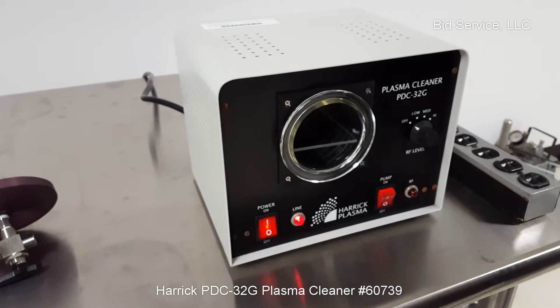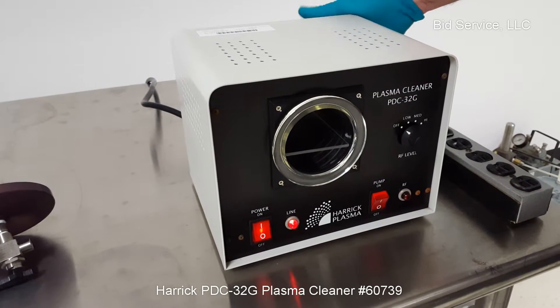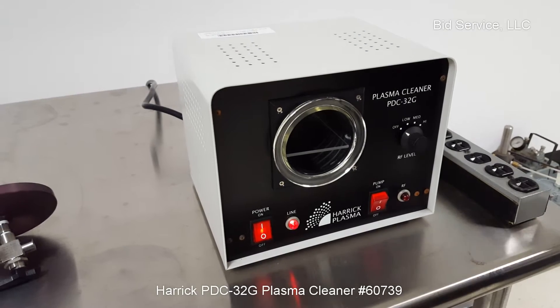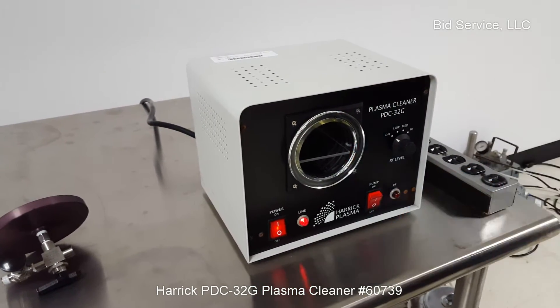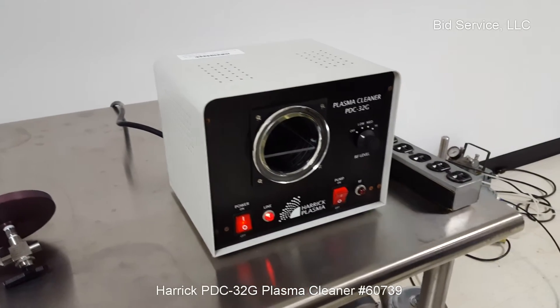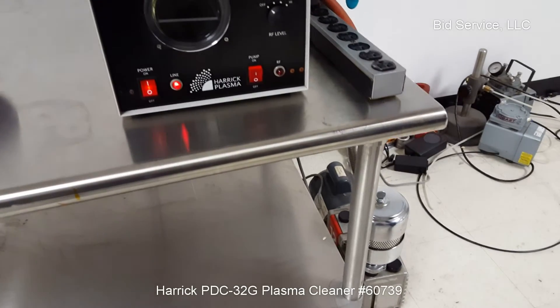On/off switch. Now there's a plug-in back here that's limited to 7 amps, so depending on your pump, you can actually turn your pump on and off using this switch. The pump I have here draws 11 amps, so I'm using this strip here to turn the pump on and off.